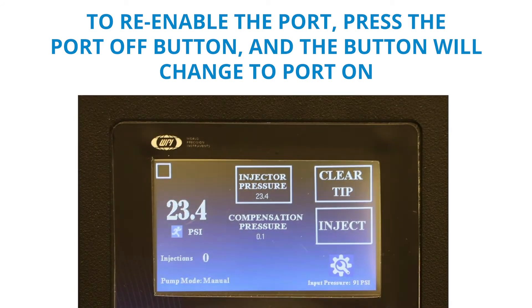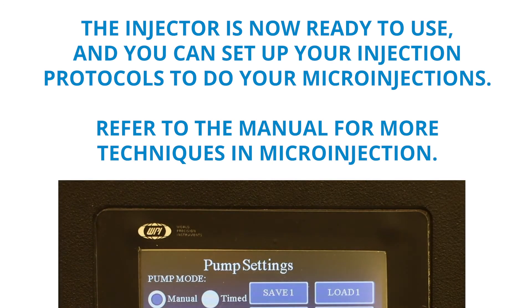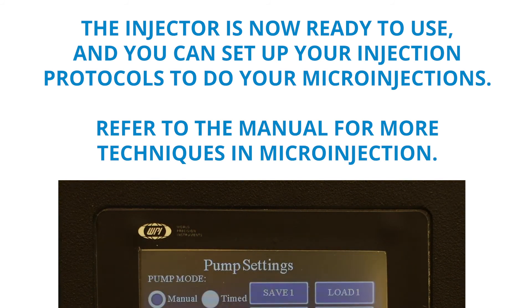The back button returns to the main screen. The injector is now ready to use, and you can set up your injection protocols to do your microinjections. Refer to our manual for more techniques in microinjection.